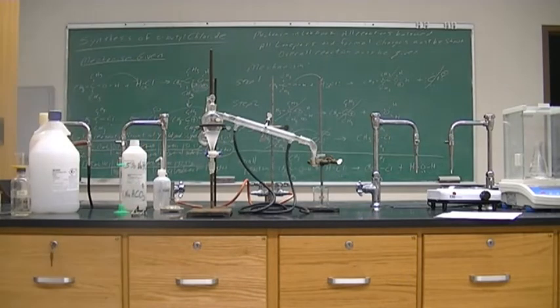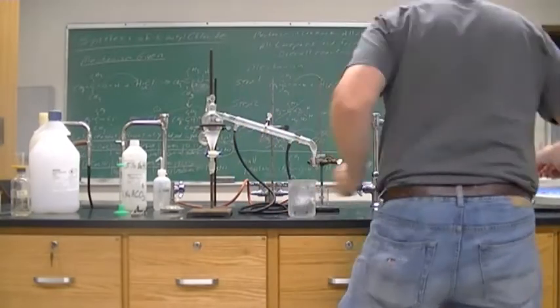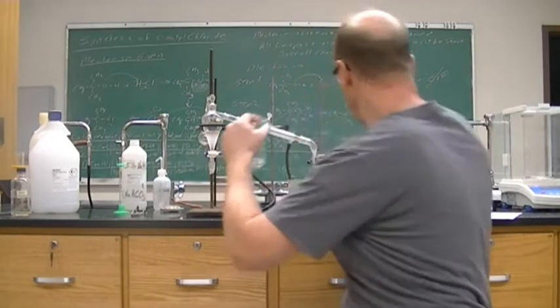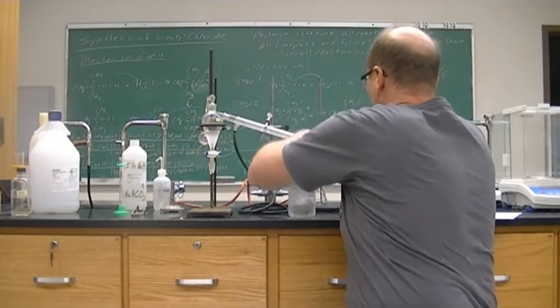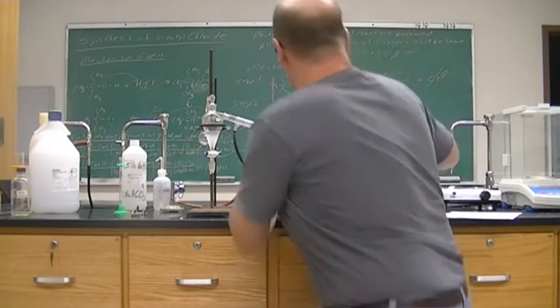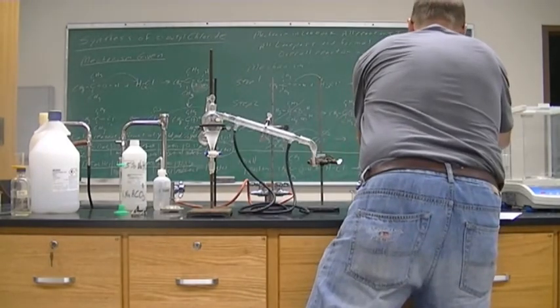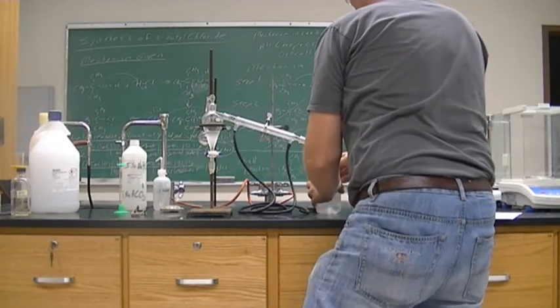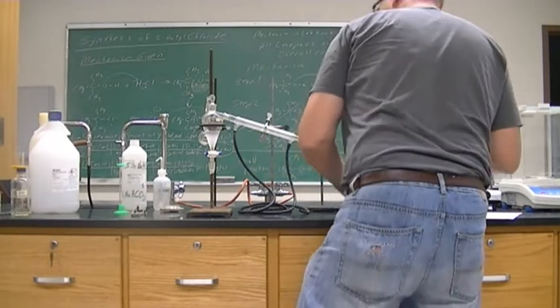I'm going to get some more ice. Less water. All right, okay. I'm going to collect it, actually, in an Erlenmeyer flask. So I have weighed my Erlenmeyer flask, and so I can collect it in my Erlenmeyer flask. I want the Erlenmeyer flask to be cold, so I'm going to put it in some ice water. That filled up quite a bit, so not that much ice.